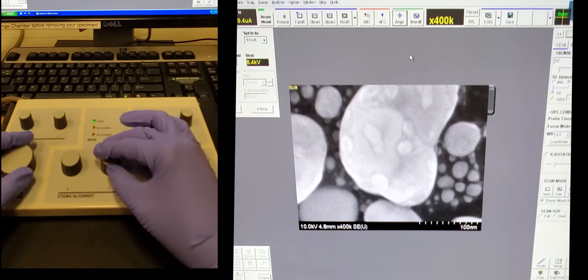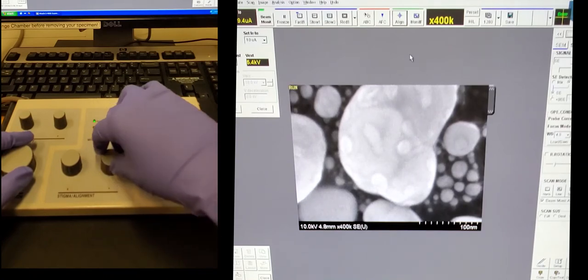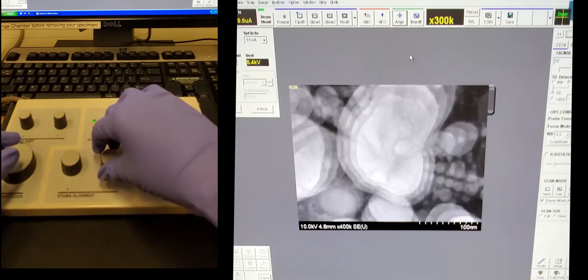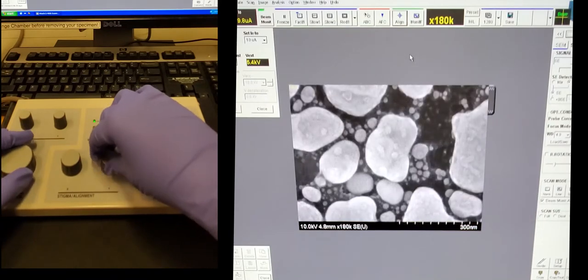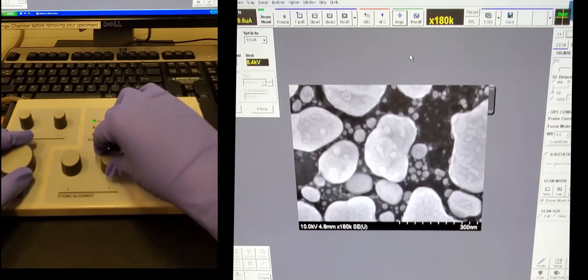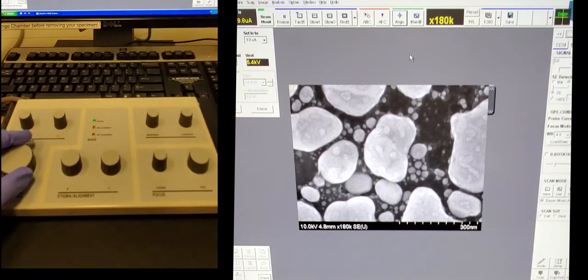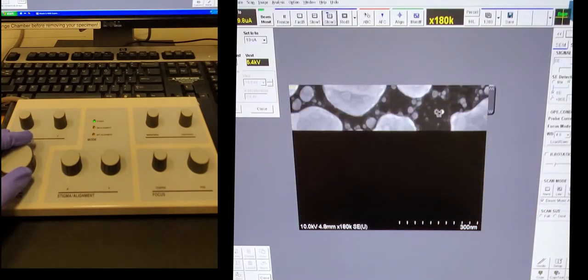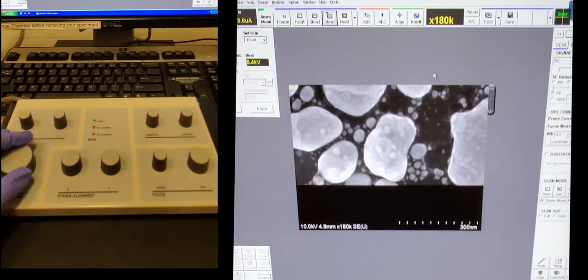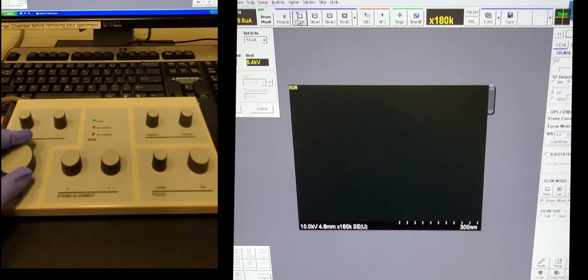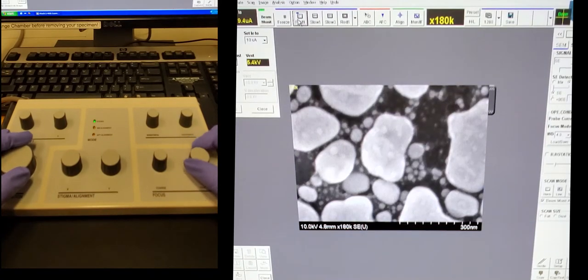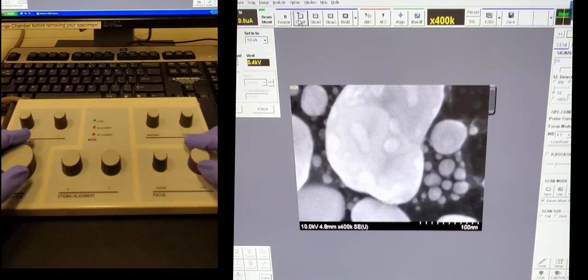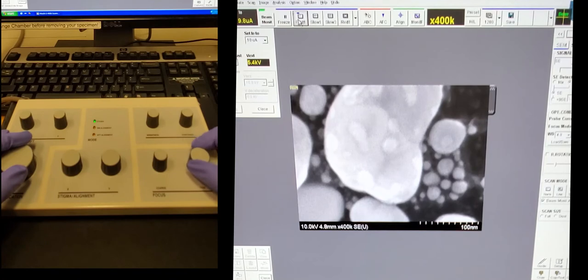So once you have the image focused and you check the stigmatism, you can change the speed. Whichever speed that you're imaging with is the one that you can also save with. You can see a lot of the graininess gets resolved when you go to the slow scan. But if your sample is very charge sensitive, scanning slow can actually make that worse and it doesn't help your image. So you have to kind of make this choice based on your individual sample.